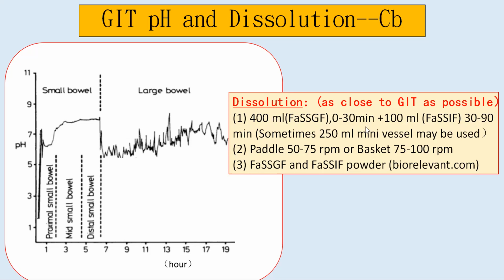In addition to this 400 plus 100 configuration, you can do the 250 ml also for low dosage drugs, okay?